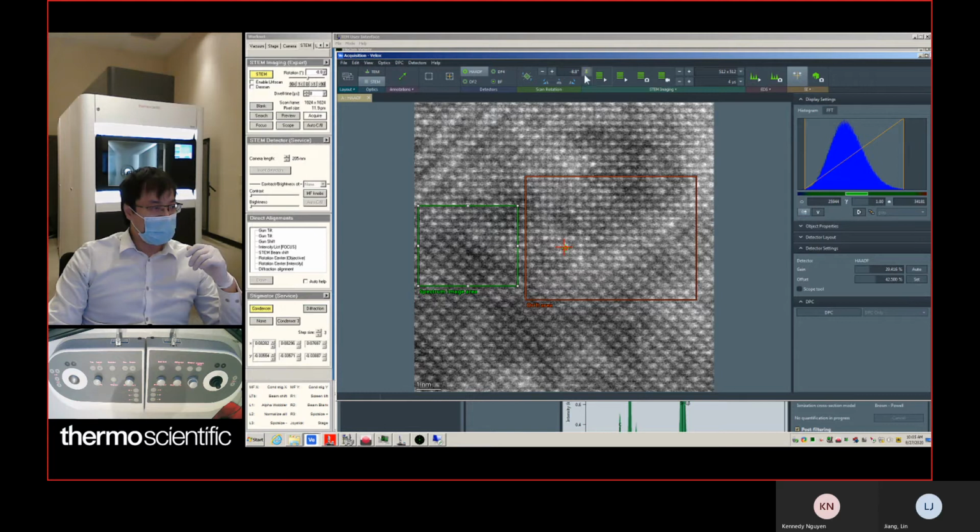Why did you have two windows? You have one for a spectrum image and one for diffraction? Drift correction? Yes. That's the cross correlation? Yes. Okay. This is spectrum. You can make the overlap, but if you do drift correction on your spectrum region, your spectrum region is gonna get more beam damage, right? Because you're scanning on the spectrum region as well.